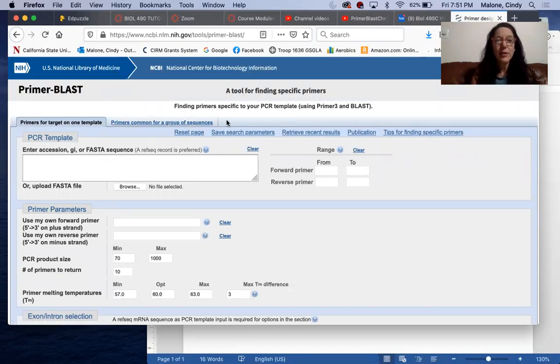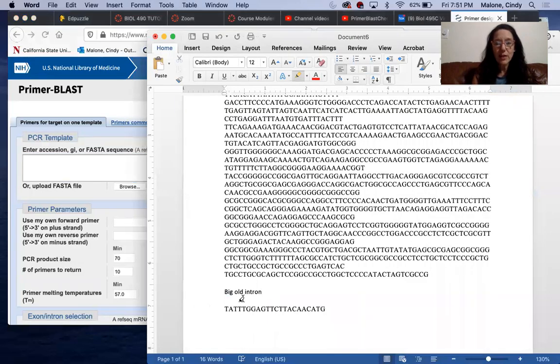Okay, so here we go. Here's our primer blast. This was from what we were doing, right? When you want to type in your promoter, if you had an intron, we don't care about this down here. We know there's a ton of sequence. If this was the end of your 5' UTR, then right here, around this sequence and this sequence, in the real world, it's just one big long line in the chromosome. It doesn't have paragraphs, is where RNA polymerase is going to sit. So our promoter's got to be somewhere right in here.